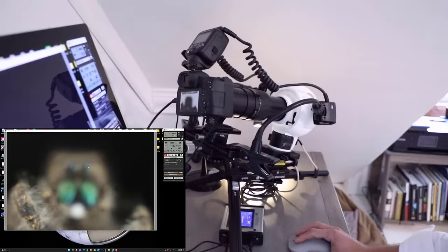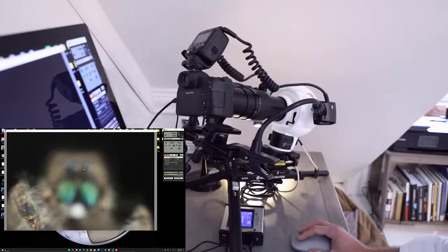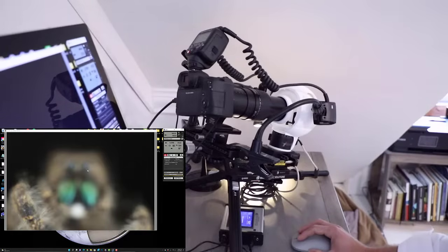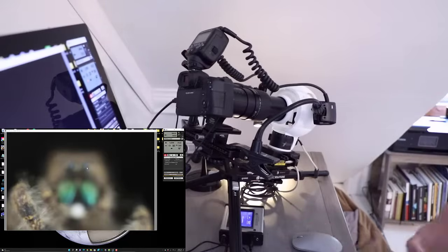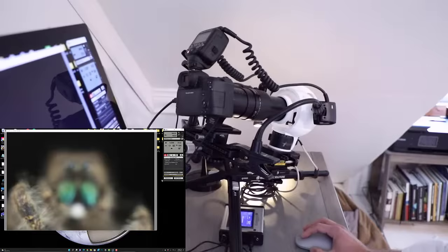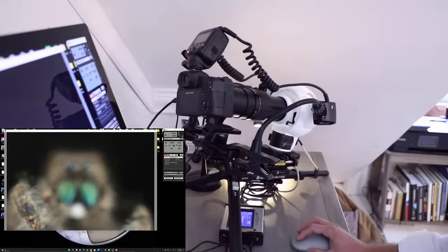You can see here even in the eyes, the eyes are going to be presented black. If we were lower magnification you're actually going to see the diffuser really well, the dome really well, and you're going to see those here. But because we're so heavily magnified we're also going to pick up on some of the natural color of the eyes as well, which is really quite neat in the end.